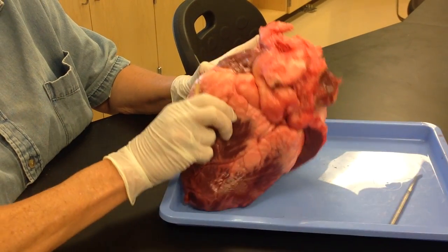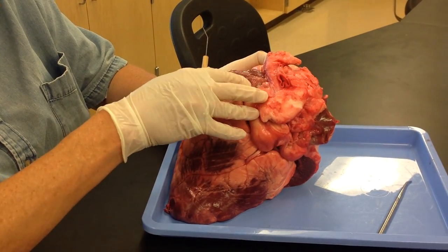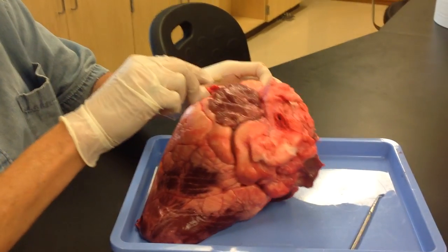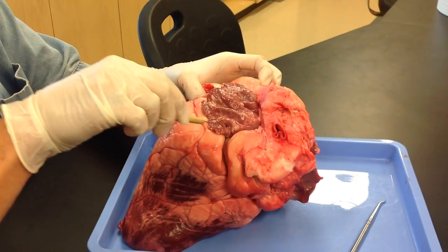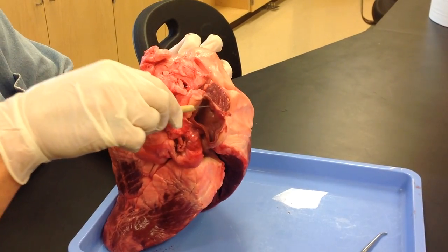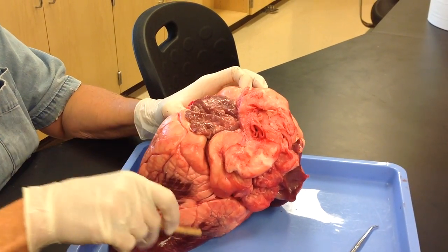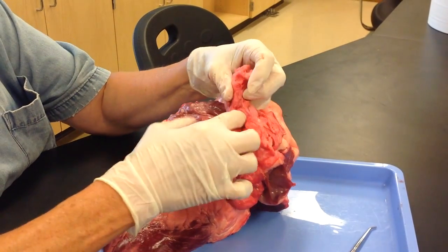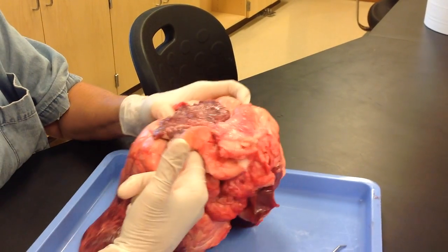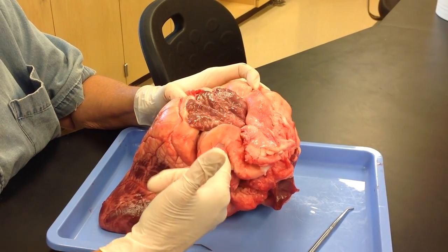On the surface, which is the base of the heart, you have your atria, which have the fringe called the auricle. This is the left atria, this is the right atria. On the left atria, you have this structure right here that goes into the left atria — this is a pulmonary vein.